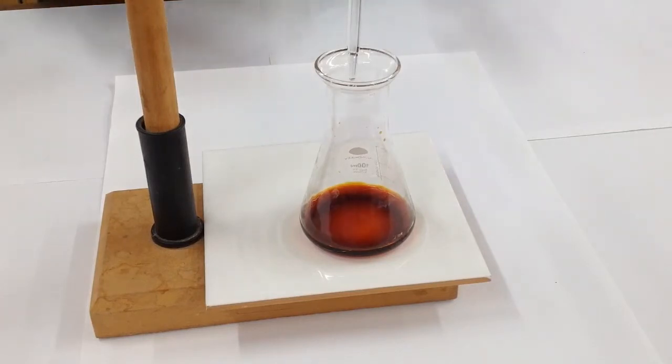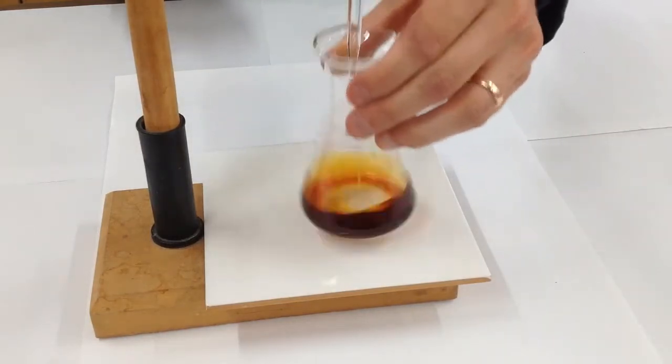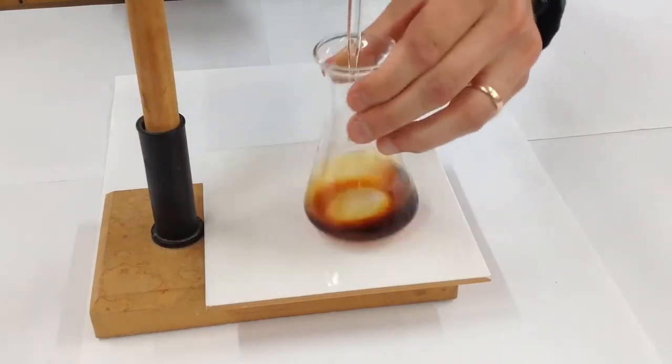So in this first video we've got some aqueous iodine in this conical flask at the bottom, sodium thiosulfate in the burette. I'm going to add the sodium thiosulfate from the burette and just give a swirl, and you can see that the colour is gradually fading.